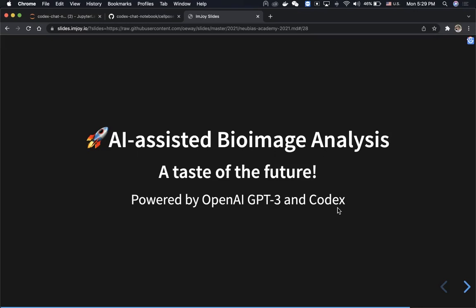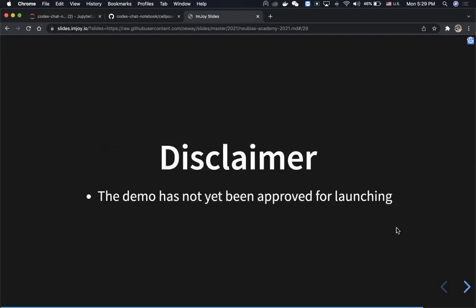In this case, we're going to show you a tool we made on top of Codex. It can take English instructions and generate Python code for performing bioimage analysis tasks, for example segmentation or feature extraction. Hopefully this will give you a taste of the future. As a disclaimer, this demo has not yet been approved by OpenAI for launching, and this video has been recorded offline.